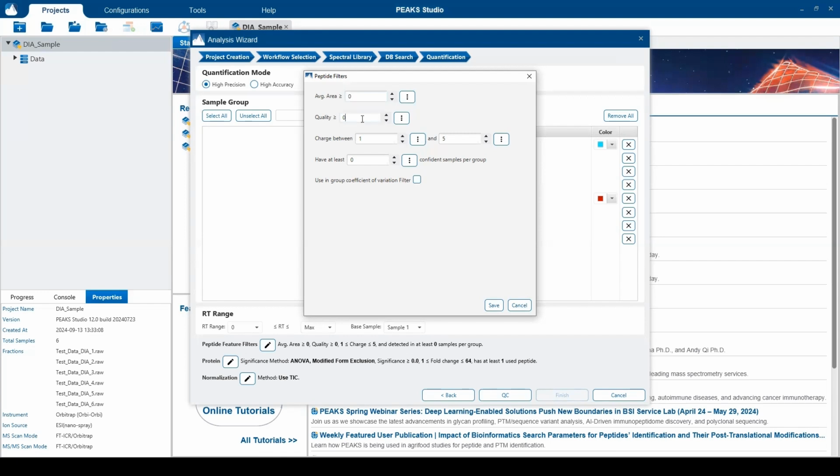The quality scores how quantifiable a feature is. Factors that affect the quality score include the similarity in M/Z, retention time, extracted ion chromatogram shape, isotope distribution shape, signal-to-noise ratios, frequencies, and intensities between the different features.